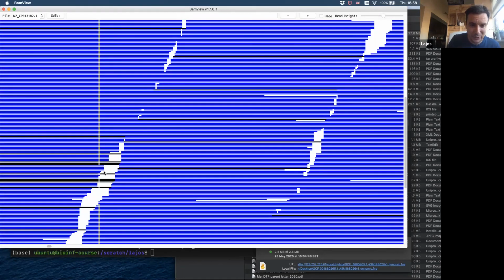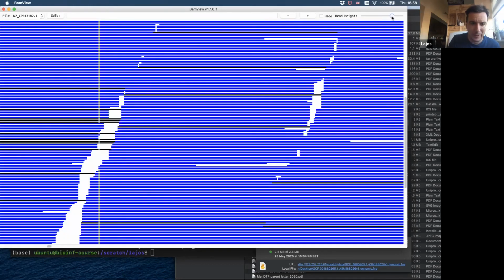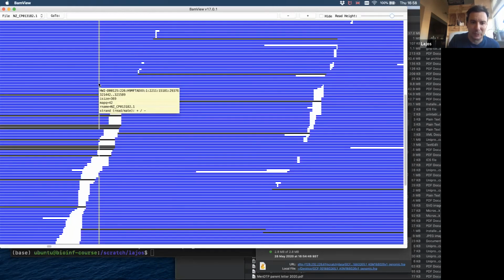You can see a few reads here. I don't know if you can see this. I will try to increase the height. Oh, maybe I decreased it. Yeah, so here we have a few reads in the middle, where at the very end, there was probably some missequencing and the end wasn't perfect. But actually, in this case, this position is almost in every other one.